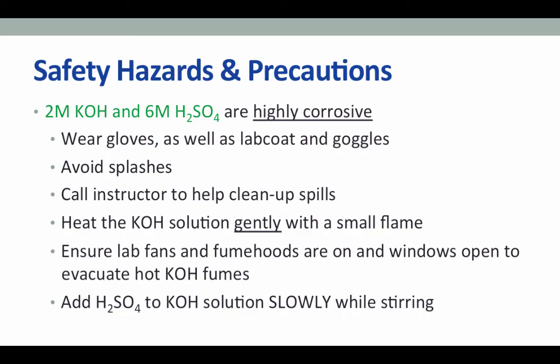Once again, ensure that the lab fans and fume hoods were turned on at the start of class before any experimentation begins, so that the hot potassium hydroxide fumes and hydrogen gas do not collect in the lab.